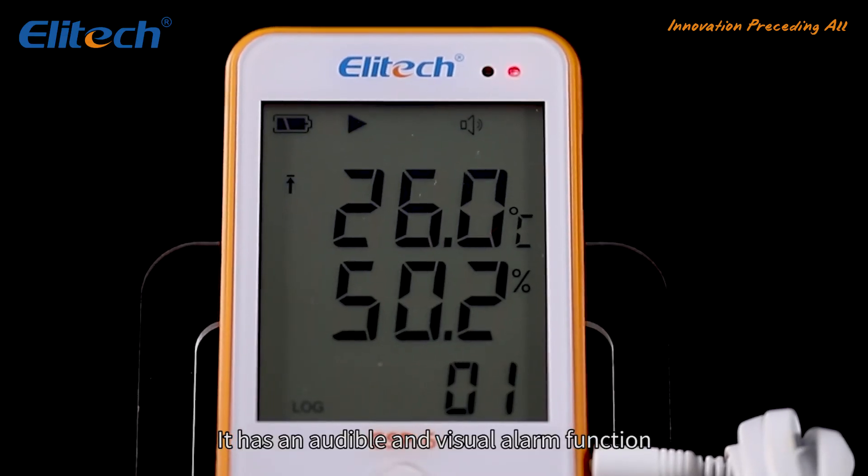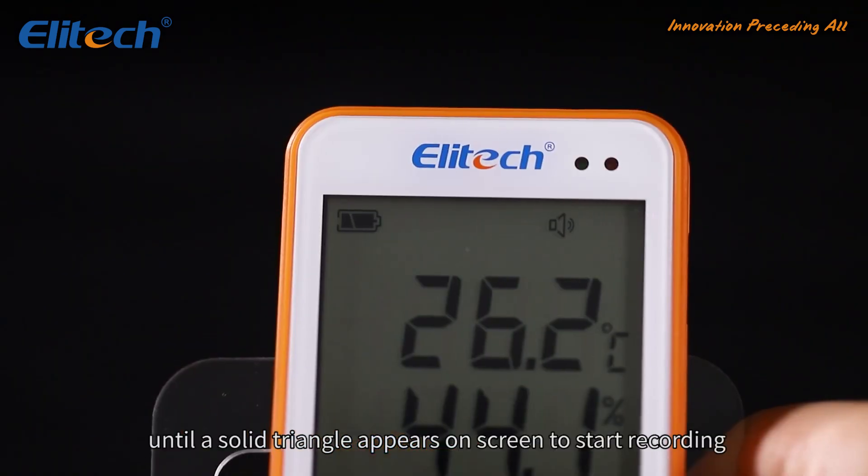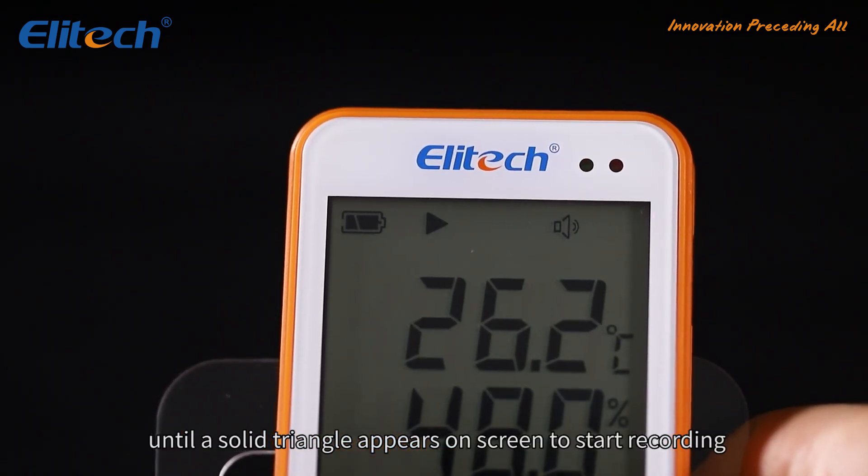It has an audible and visual alarm function. Press the button for about five seconds until a solid triangle appears on screen to start recording.